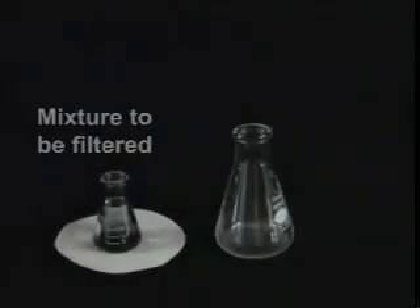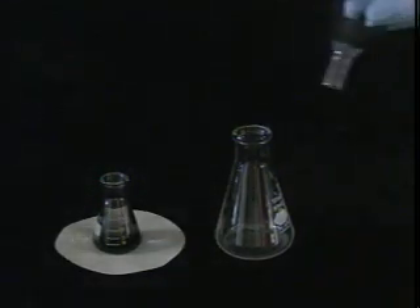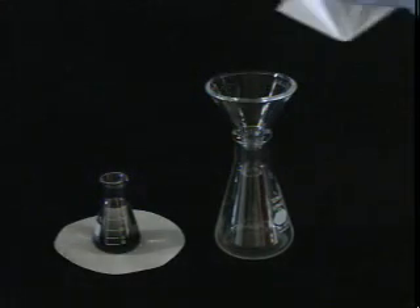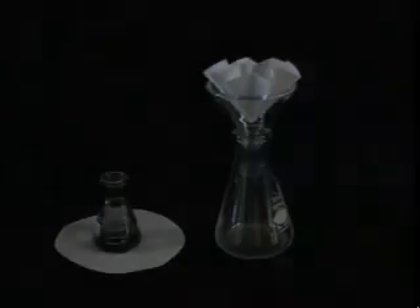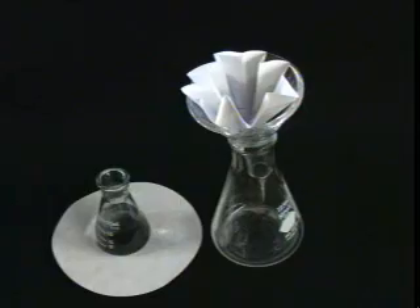Now for the setup. Here we have our mixture to be filtered, and here we have our collection flask. Into the flask, place your funnel — it should be appropriately sized. And into the funnel, place the fluted filter paper. Now that we're all set up, it's time for filtration! Pour the mixture onto the filter paper, being sure not to pour too much that it overflows. As the filtration progresses, add more of the mixture.